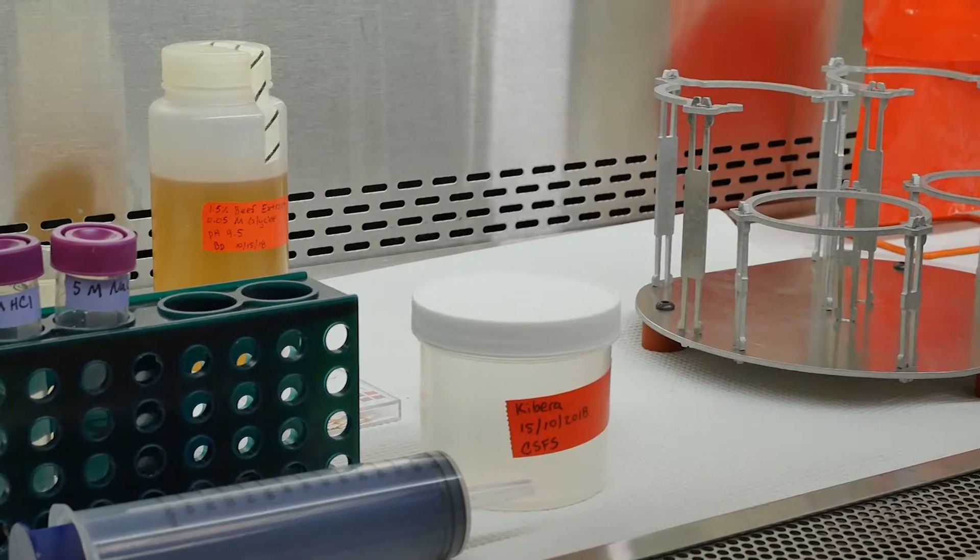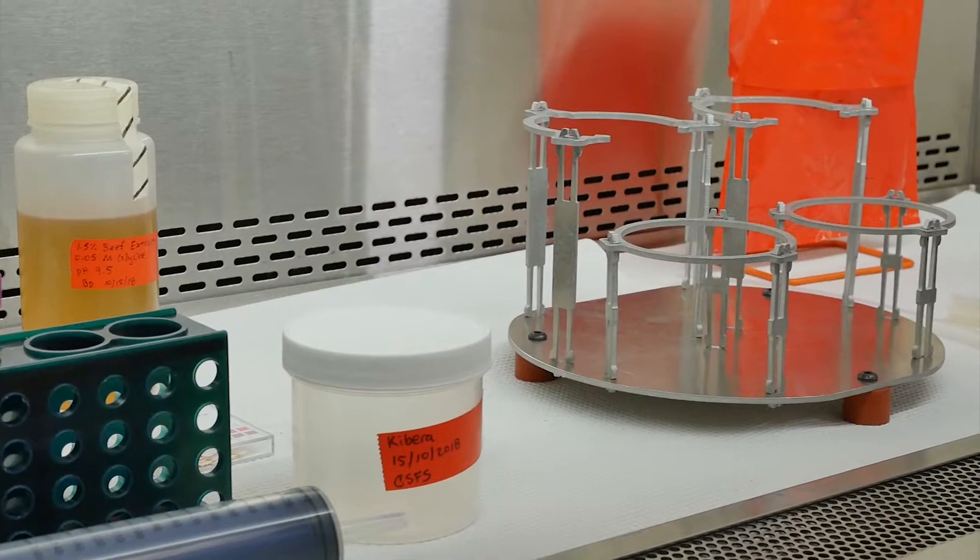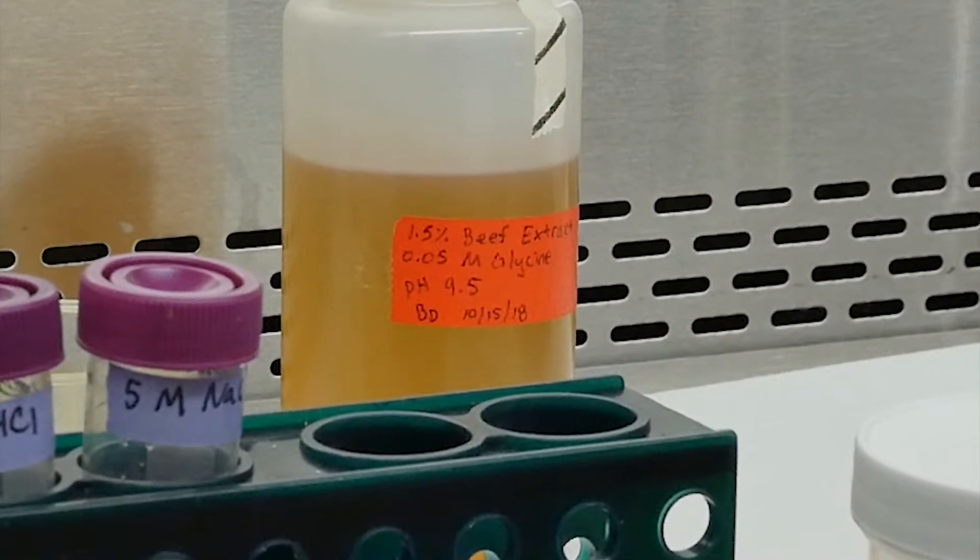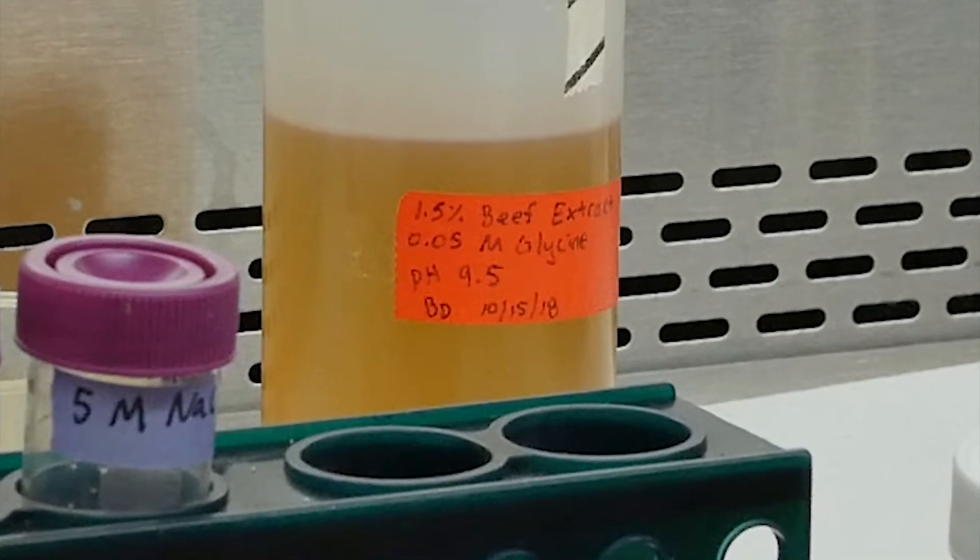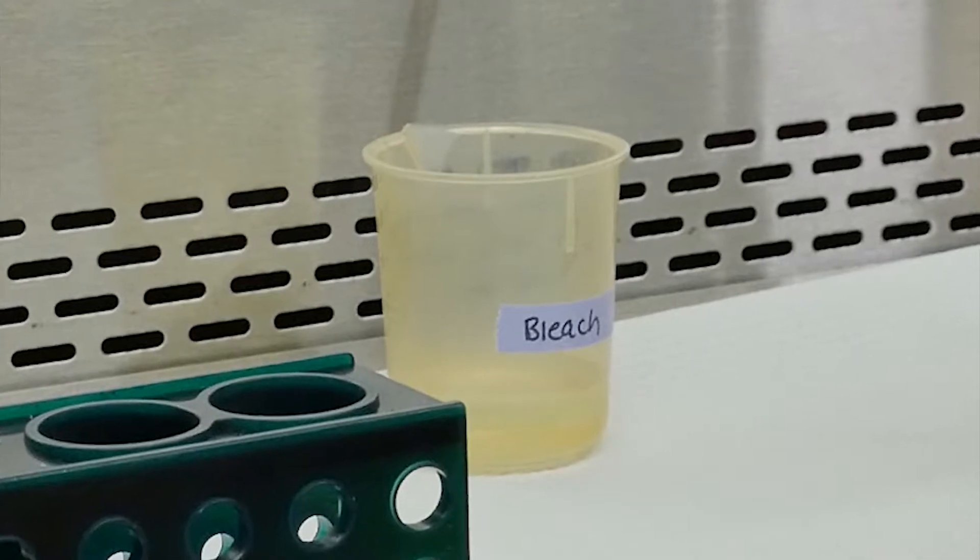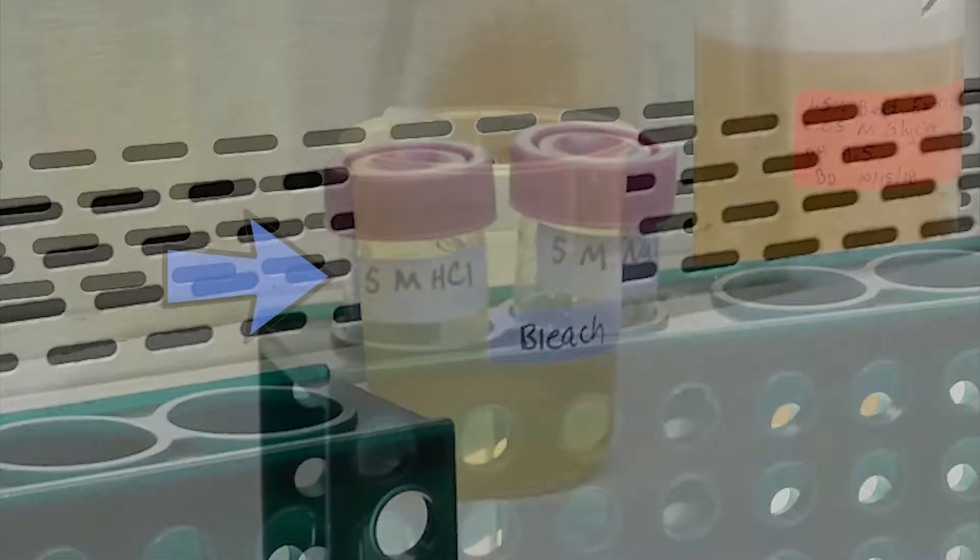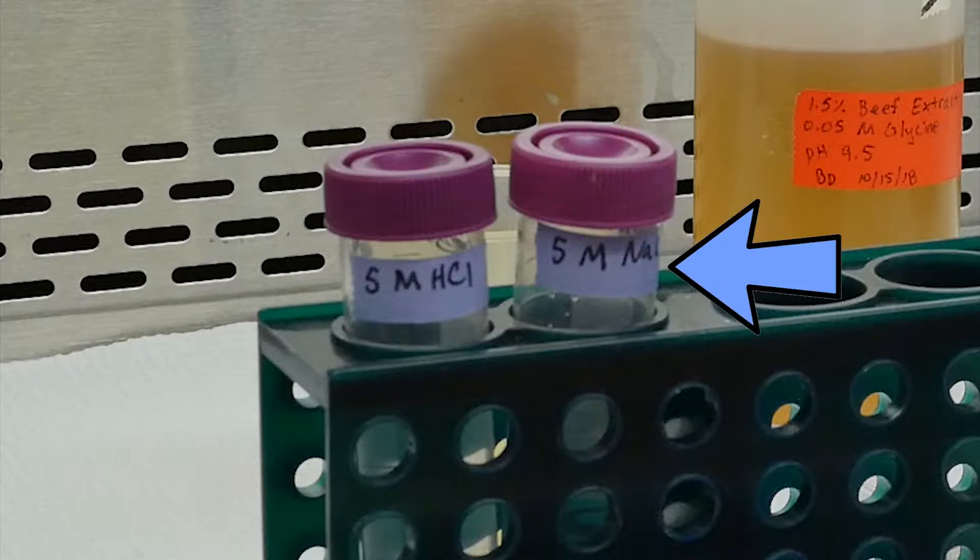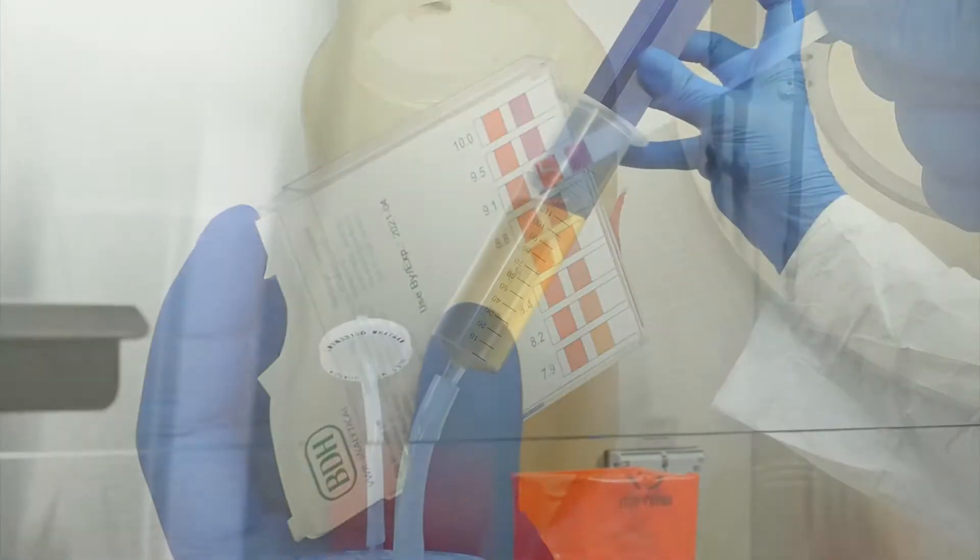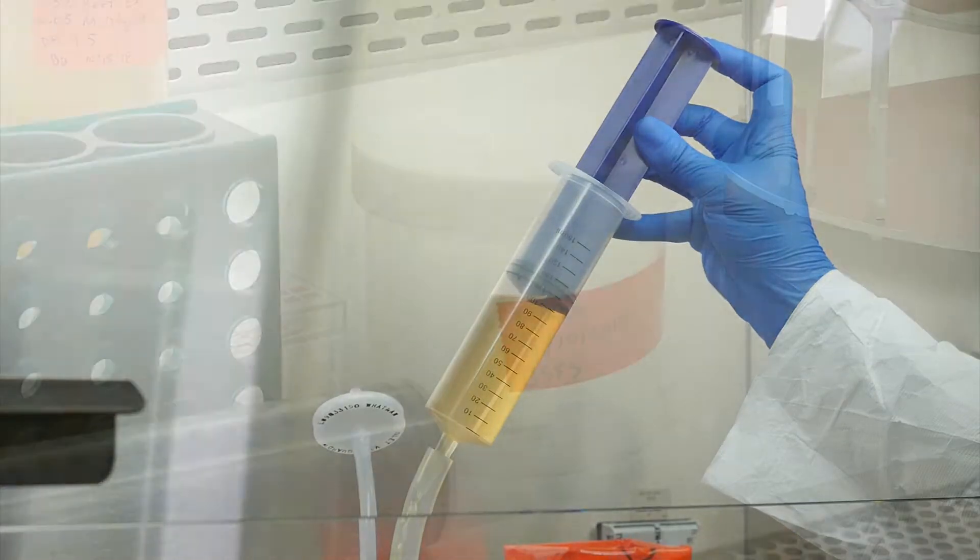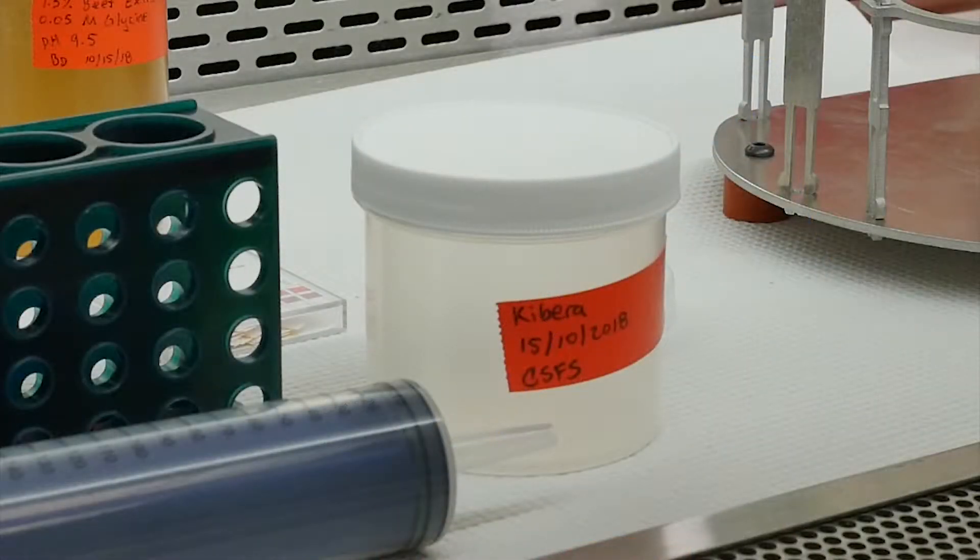You may then place the reagents and materials inside the biosafety cabinet, including 300 milliliters of sterile 1.5% beef extract with 0.05 molar glycine at a pH of 9.5, 50 milliliters of concentrated 5% bleach solution in a small beaker, 5 molar hydrochloric acid, 5 molar sodium hydroxide, pH strips with a range of 6.0 to 10.0, one syringe for eluent injection, a collection bottle with at least 300 milliliter capacity. This should be labeled with appropriate sample identification information, for example, include the filter ID, sampling location, date, and your initials.